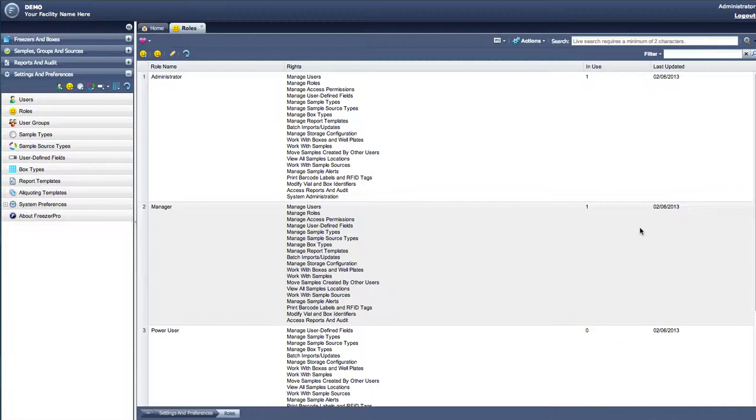The last option in the toolbar is to refresh the view. This is a useful tool as it will help assure that all changes regarding roles in the system are current should another administrator be making changes while you are viewing or editing roles. To refresh the view, simply select the Refresh button at the top of the toolbar.